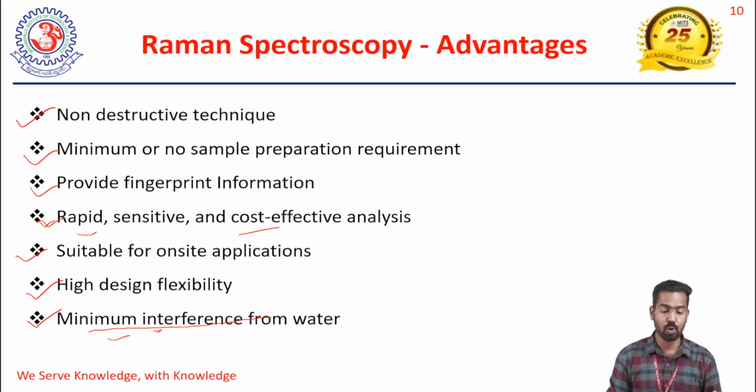So that is very, very important. This point is very, very important. Why does Raman spectroscopy have that much importance in the field of biomedical applications? This is the only reason: minimum interference from the water.